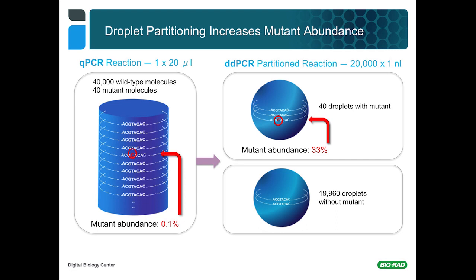Now for the second type of droplet digital PCR, we have here the case where you're looking at a rare mutation, and partitioning enables you to actually take the ratio, the very imbalanced ratio. You normally have a wild type assay and a mutant assay, and partitioning makes it much more possible to detect the mutant DNA against the background, where normally the incomplete specificity of the assay is obscured in a non-partition reaction.